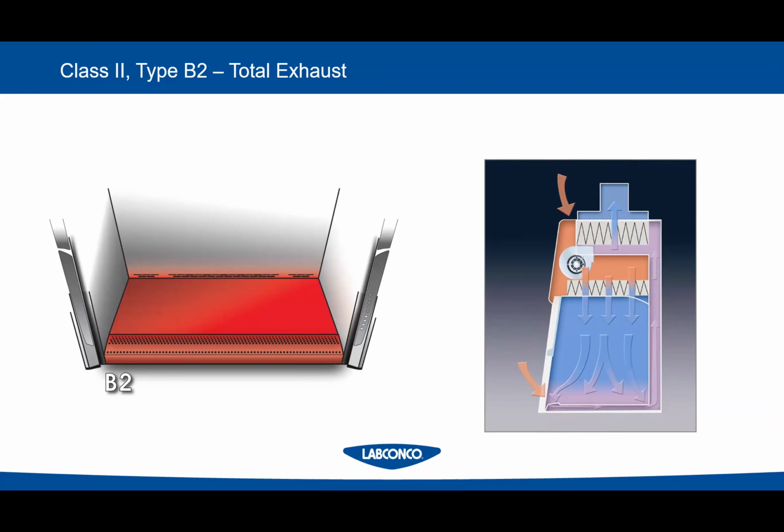All right. But these cabinets are also notoriously tricky to get to run, especially if you have several of them and you want to put them all on the same exhaust system, because that's what everybody wants to do because it makes it easier. However, they will trip alarms. There's all kinds of issues. All the lab ventilation standards out there say these should have their own exhaust, their own blower, for each unit. They're tricky to link together.